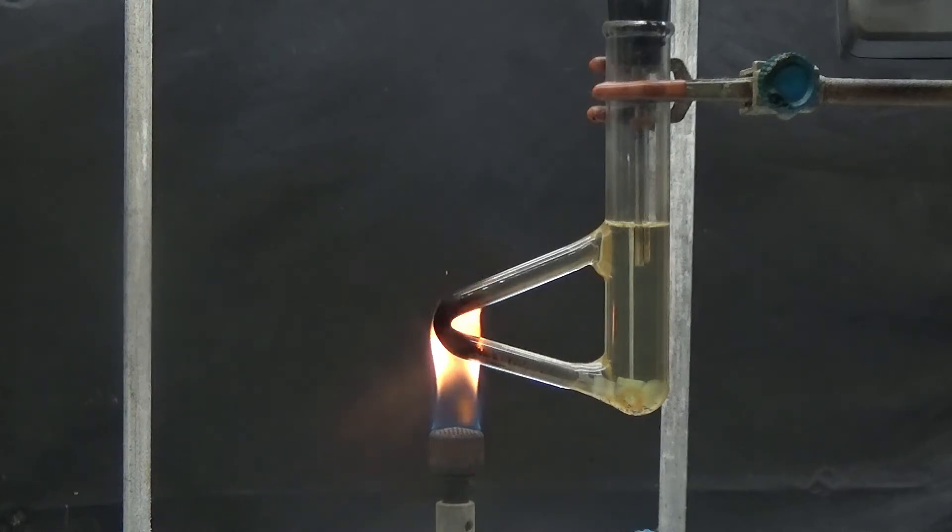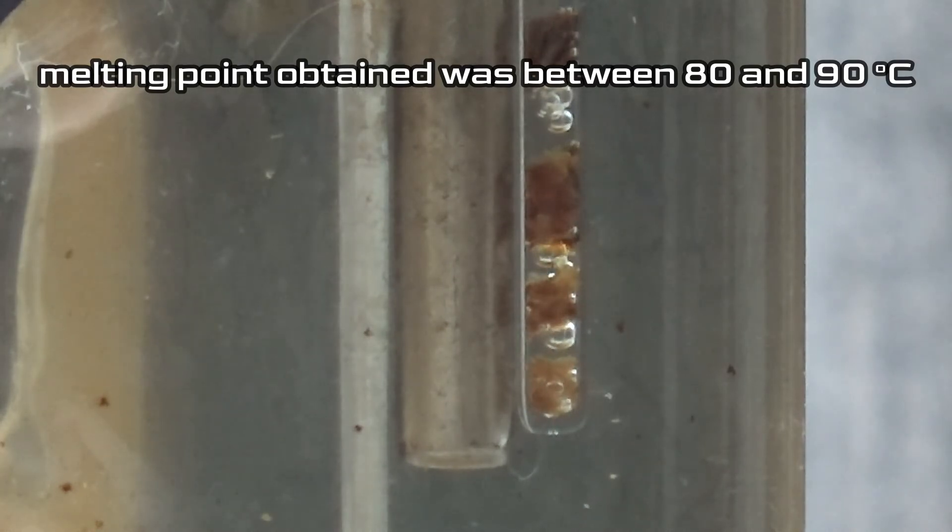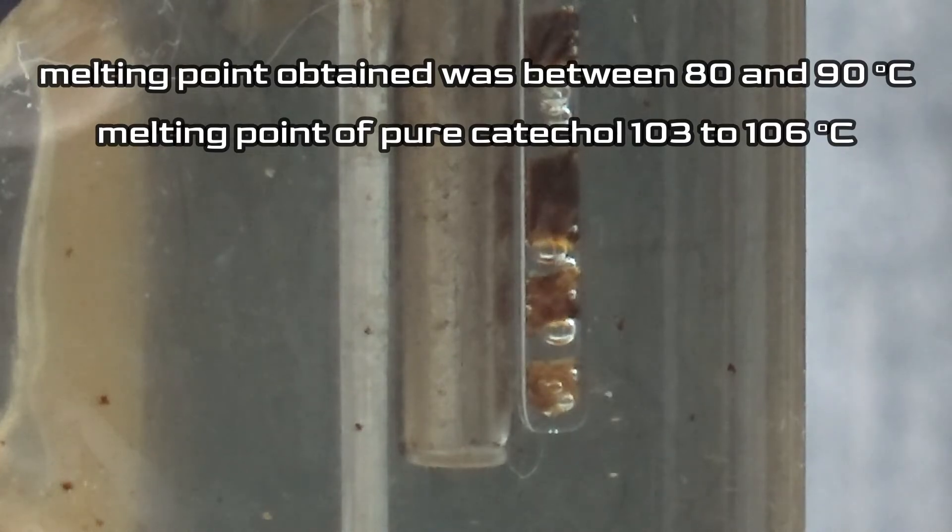We have let the product dry by heat at 40 degrees for a few hours and the melting point has been checked. The melting point obtained was between 80 and 90 degrees, a very low value. The melting point of pure catechol is 103 to 106 degrees.